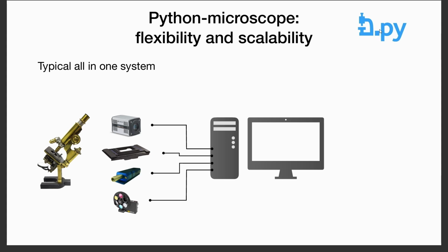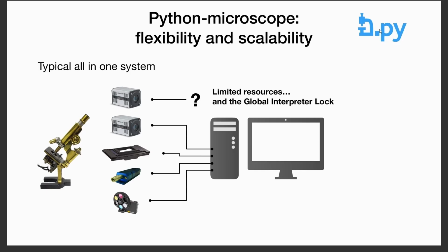Talking about flexibility and scalability: normally, you connect the different microscope devices to a PC. But at some point you might run out of resources.